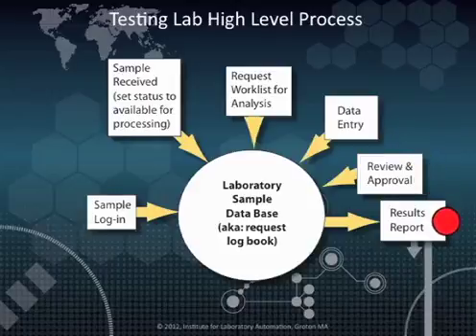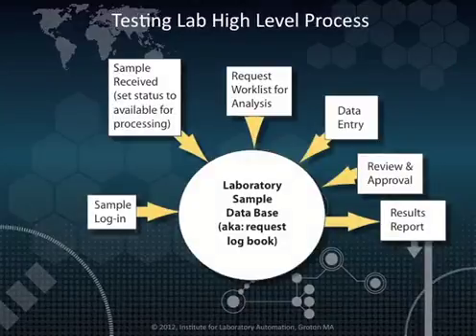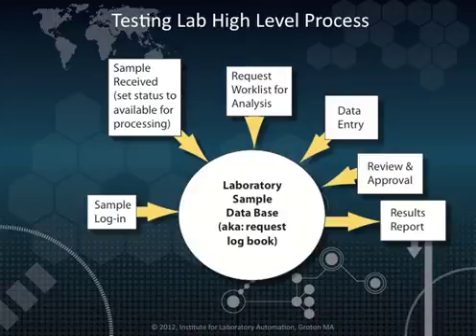In small laboratories with limited testing, paper systems were adequate, but as laboratories grew, the testing became more complex, and the sample volume increased. Electronic systems provided a lot more capability and improved the administration of laboratory work. They also made it easier to meet the demands of regulatory requirements.